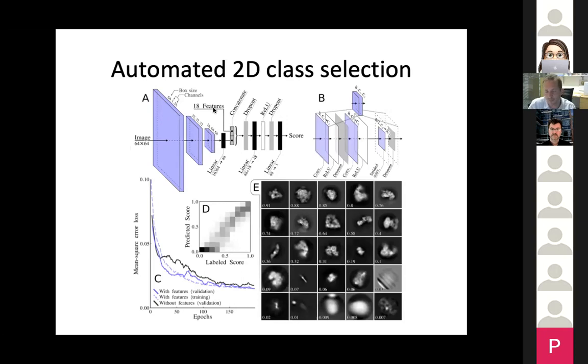Some of these are just metadata that come out of RELION, so the accuracy of rotational and translational alignment, how many particles are in each class, etc. But some of the features were also calculated by Lee based on dividing the density into protein and solvent areas and, for example, calculating moments in those, as an attempt to help the neural network do better. In the end, we trained this whole neural network to predict the score for each of the 2D class average images, using the manual annotation that Lee had done of all the scores on the training and the validation test sets.